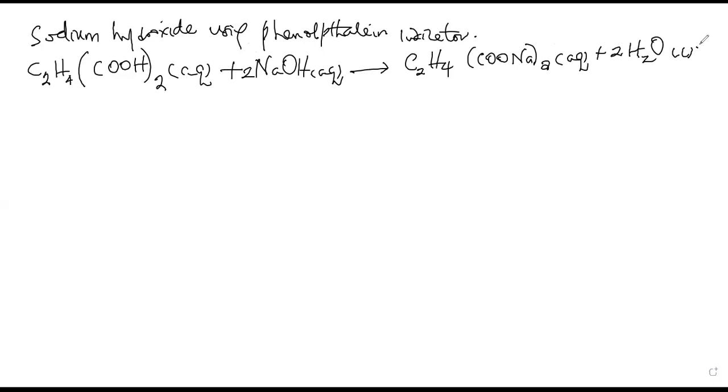Now, since the sodium hydroxide is standard, it means that from the volume of the standard sodium hydroxide solution used, the concentration of butane dioic acid in the aqueous layer is determined. That is the step we put.